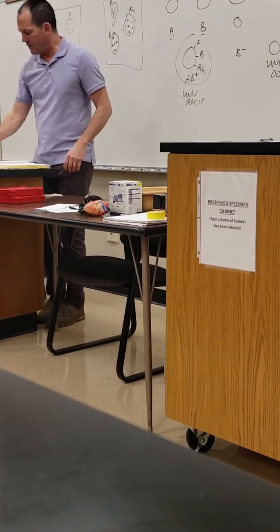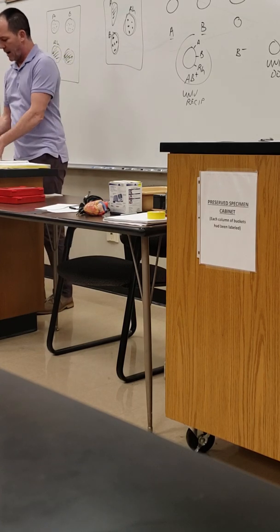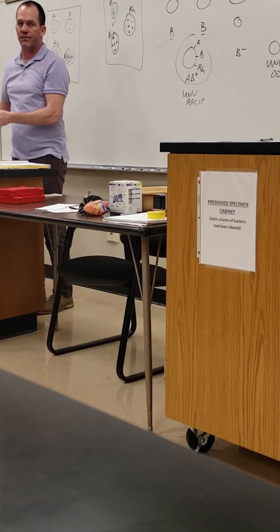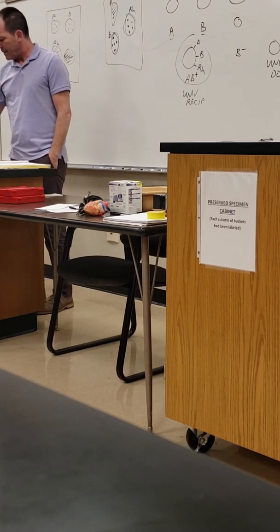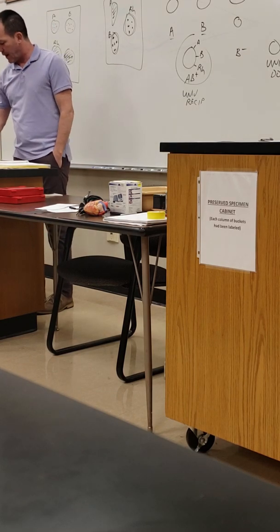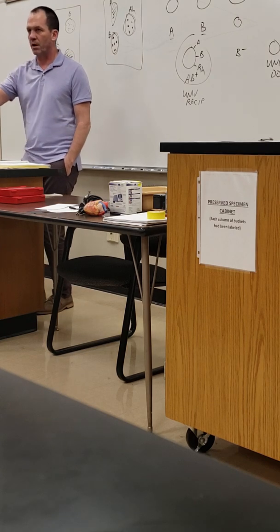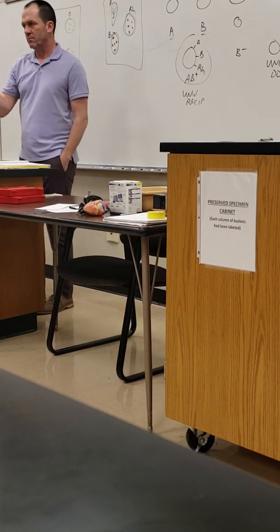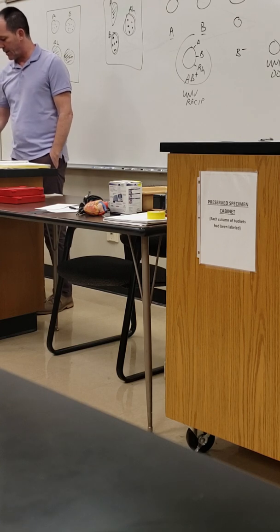Now, in my slide box that I'm looking at right now, which is the same one you got, the same one they have in the Science Learning Center for the most part, we've got 7 endocrine system slides. We've got 1 basic blood, and then 2 or 3 blood disorders, right? So you probably get one of those on there. Then we go into the heart and blood vessels.